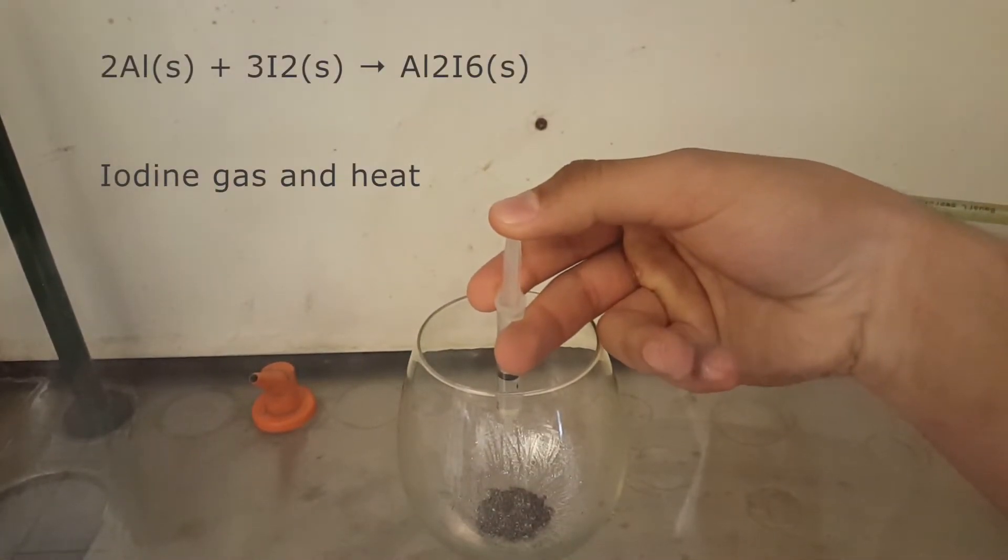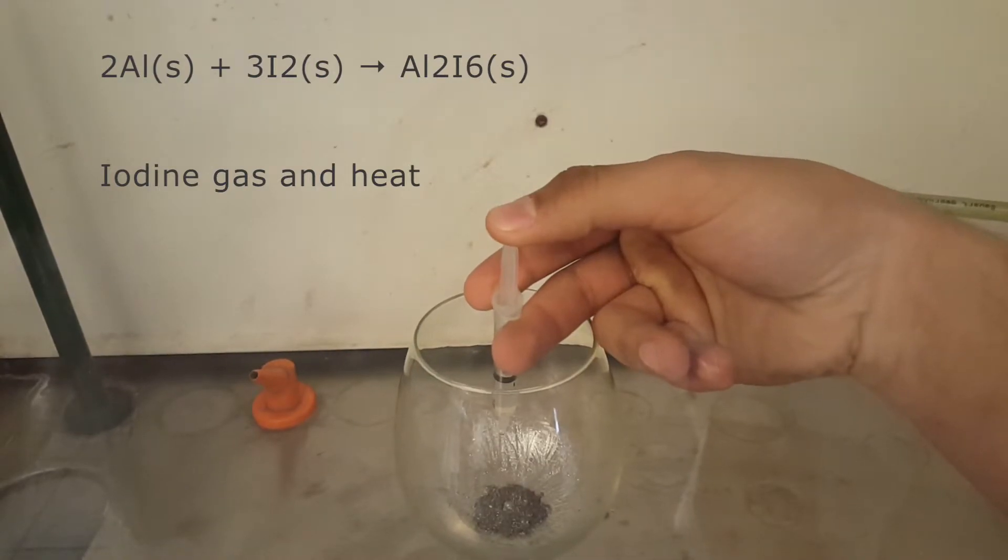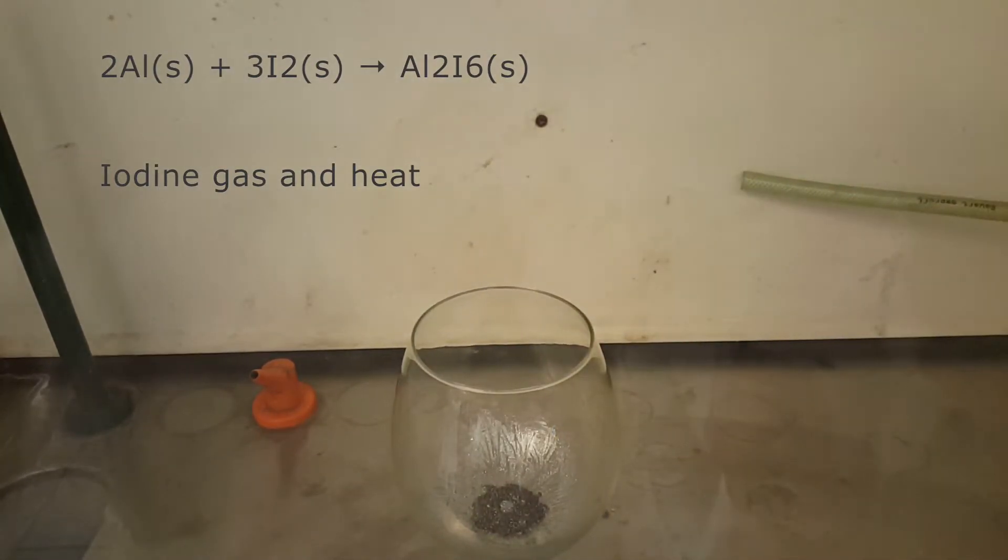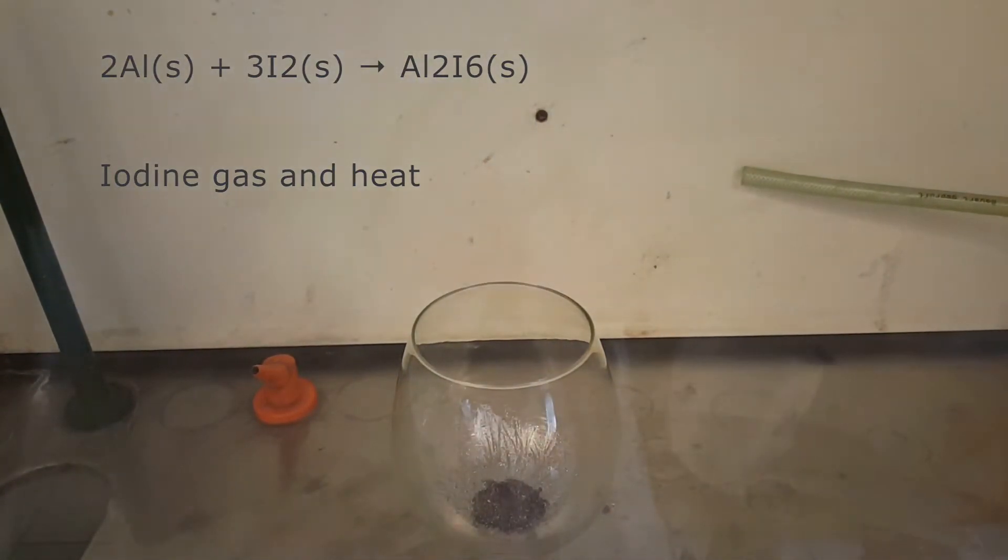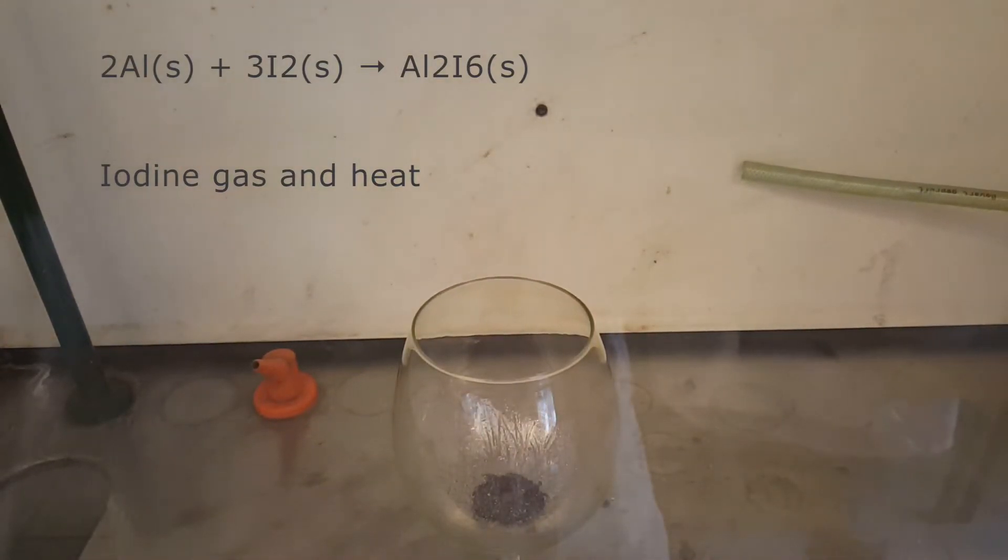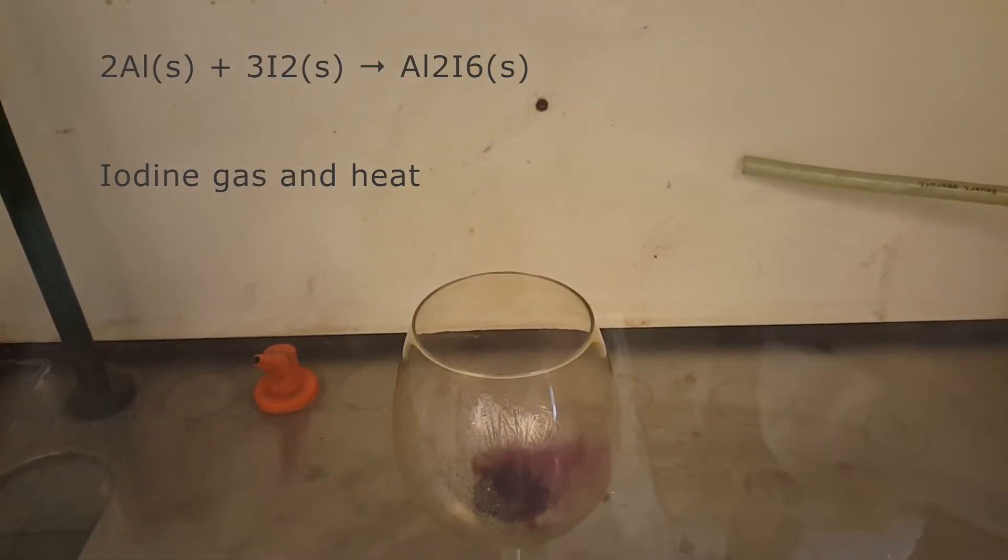The water works as a catalyst to get the reaction between aluminum and iodine started. The product of the reaction is aluminum triiodide and iodine gas, which is the purple smoke we see.